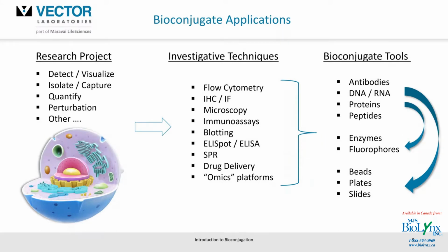Or what if I could quantify or perturb a given cascade or signaling pathway in my study? Could you push that particular research further and probe new areas? And this is where the bioconjugate tools come in.